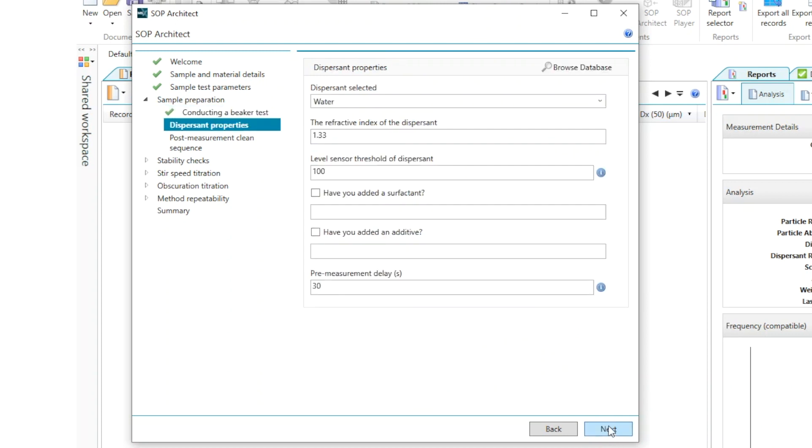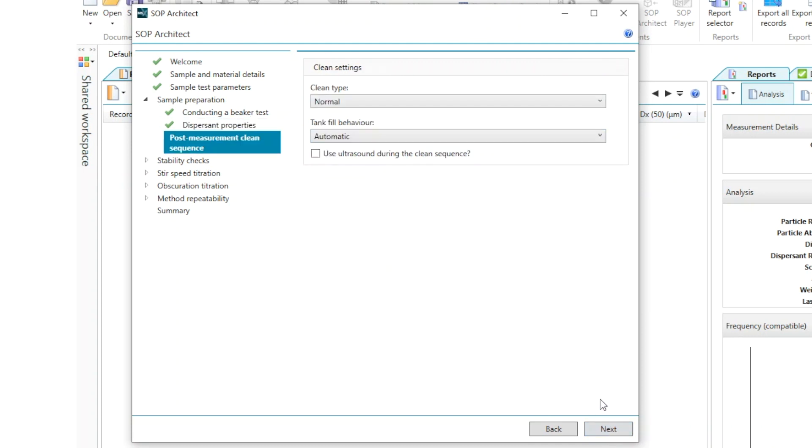As well as other options such as selecting the dispersant that we're going to be measuring. So as I've said we'll be measuring in water and we've got the refractive index input here and we also have the option of selecting the cleaning steps that we would like to perform after the measurements are carried out.